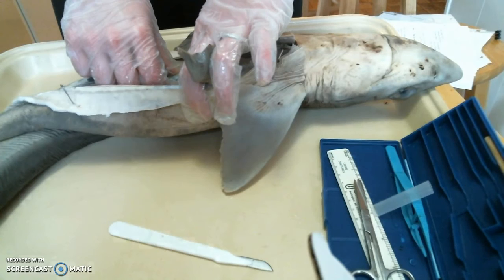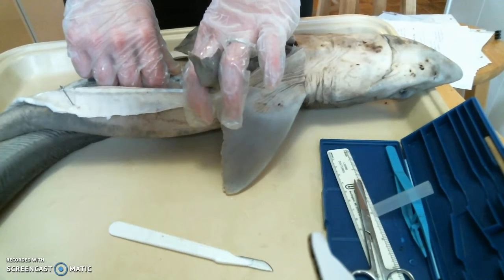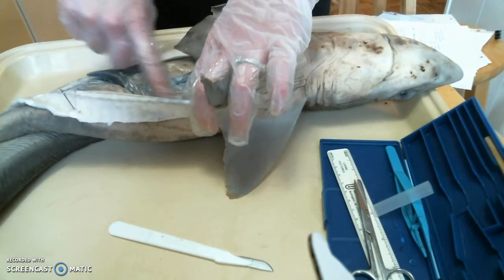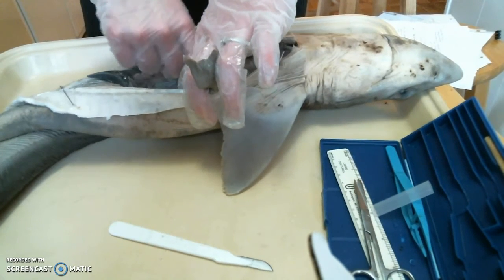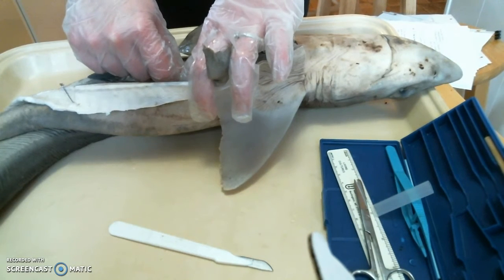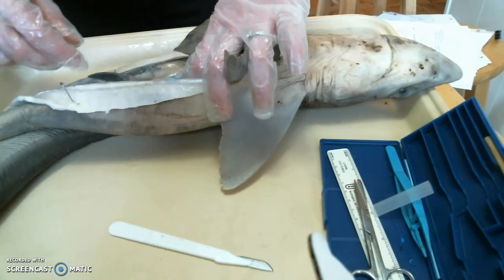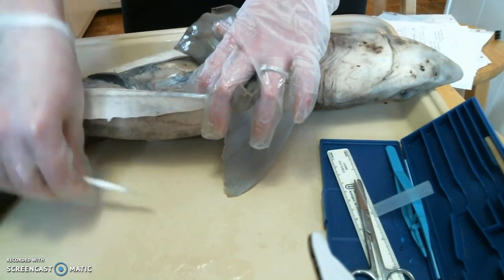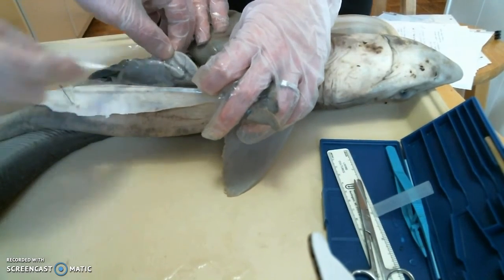A lot of things I've read have said that people will open the stomach. It says they cut the stomach open along the long side, so I guess that's this side, where the main part of the J comes down from the esophagus, just to see the contents. They said you might see fish, squid, things like that. To me, this seems pretty empty. But do you want to try it? While I hold the lobes, I'm going to cut open the stomach and see if we see anything interesting in there.